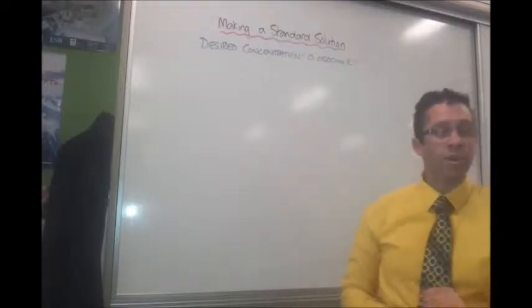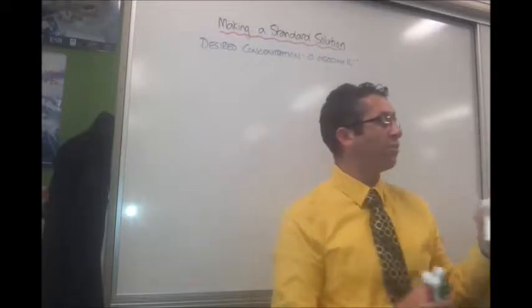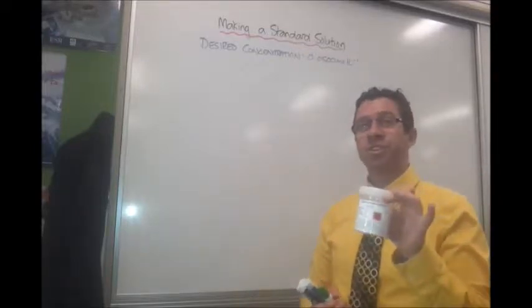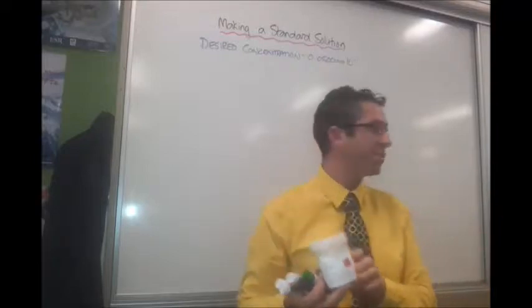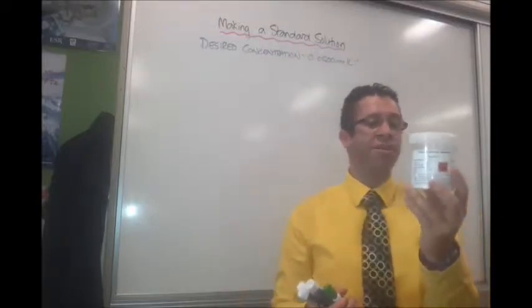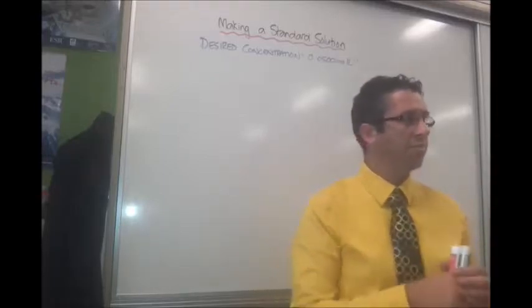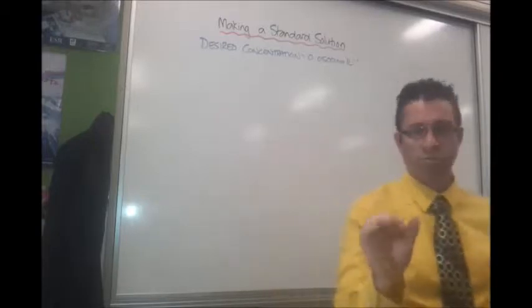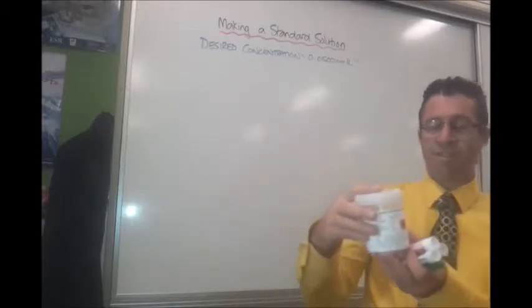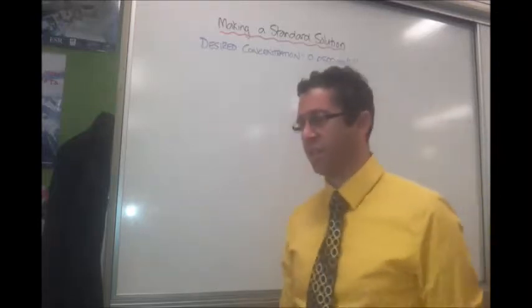And the other thing that we're going to know is that this salt is not going to react with air, so it's absolutely pure. So what we've got here is what we call anhydrous sodium carbonate. So it looks different to the sodium carbonate that you use for washing your clothes, because that looks a bit like an opaque crystal, relatively large. This is a very fine powder, so it's a little bit different in its appearance.